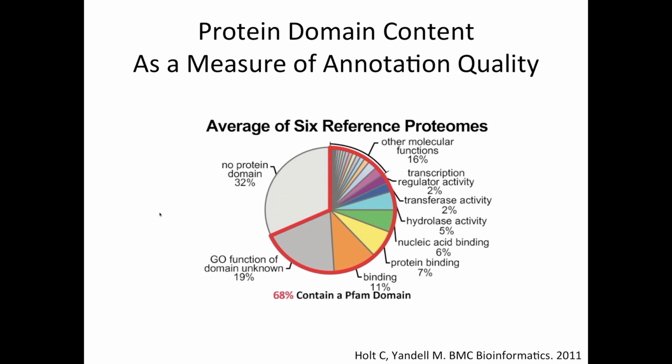So we don't have that luxury in many novel emerging genomes these days, and so we need a slightly different metric. And it's fairly well known that consistently across many well-annotated genome sets, when we compare the genes back to PFAM domains and the GO database, we will be able to annotate some kind of functional category or some kind of a GO domain to about 2/3 of those genes.